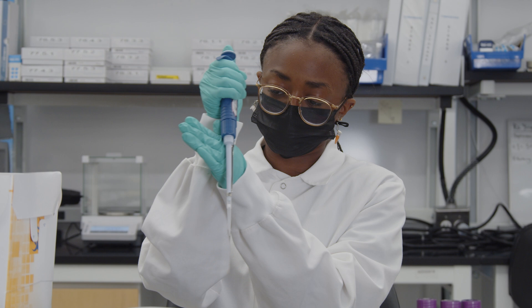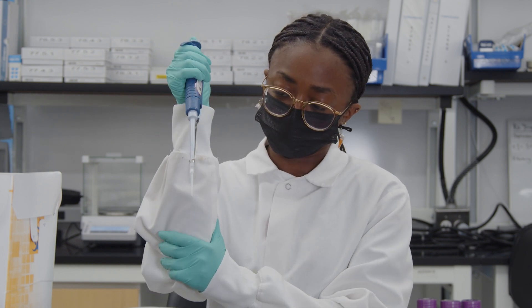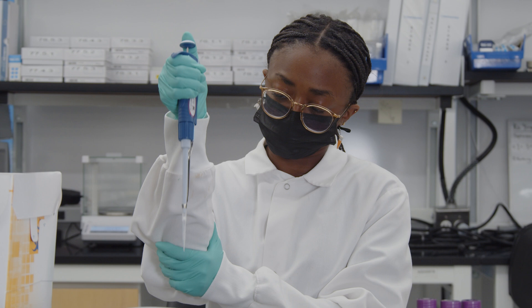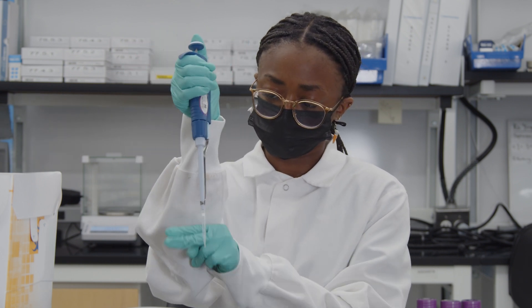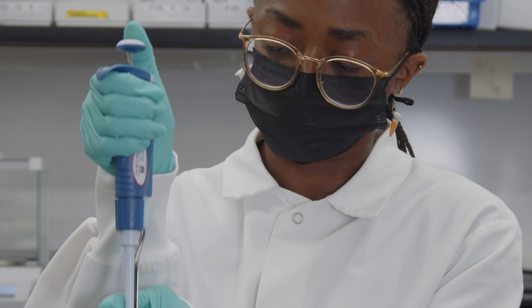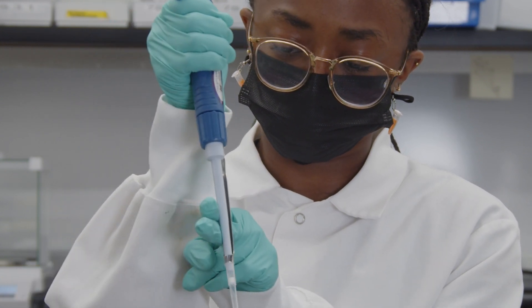While trying these, move your hand around and get comfortable, trying to find the most stable up and down motion as you can. Don't wait until your pipette is noticeably shaking to do this, though. Practice beforehand, finding what works best for you. And make it a habit. That way, you'll always have a steady hand.